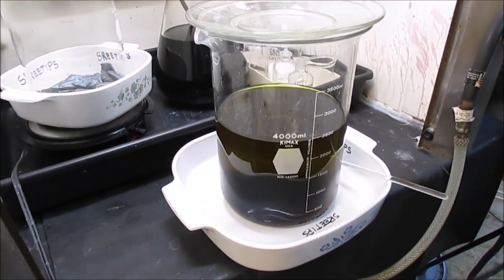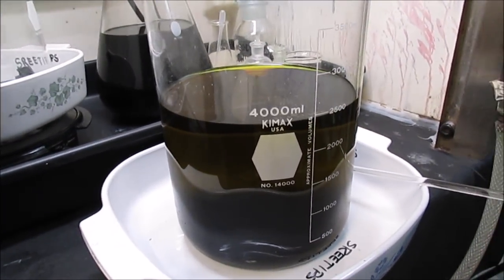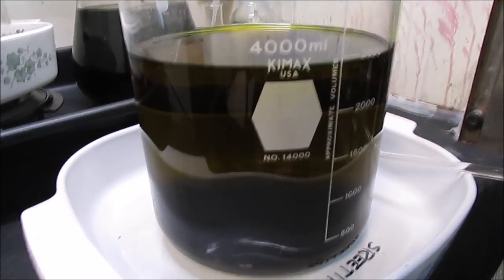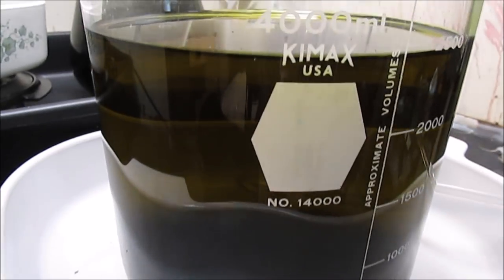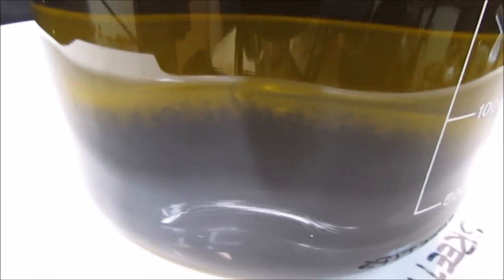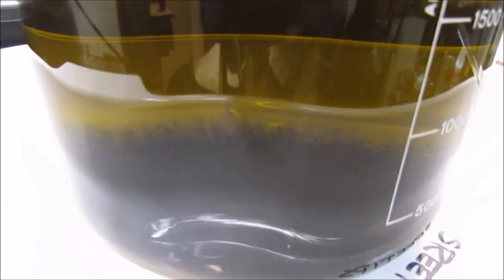It is 8:30 a.m. the next morning. I've allowed this to settle overnight. I think I knocked off about 9:30 and went to bed. Came out this morning and the gold has settled completely. There's our gold down at the bottom. What we'll do now is siphon this off and recover the gold and get a yield.